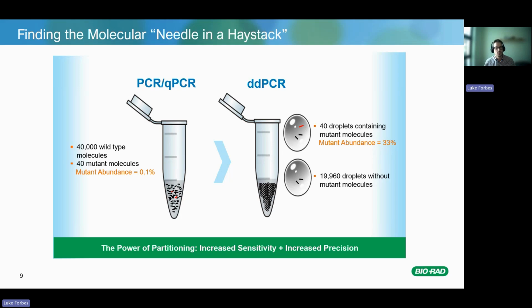When you do this sort of method, you don't count every single fish in that dam. You kind of track how quickly you can catch fish, maybe, and that's like an amplification curve. And then you compare that to a known lake or a known dam, how many fish are in there, which is your standard curve. So you see, okay, I can catch X amount of fish in this amount of time. That's your amplification curve in real-time PCR.